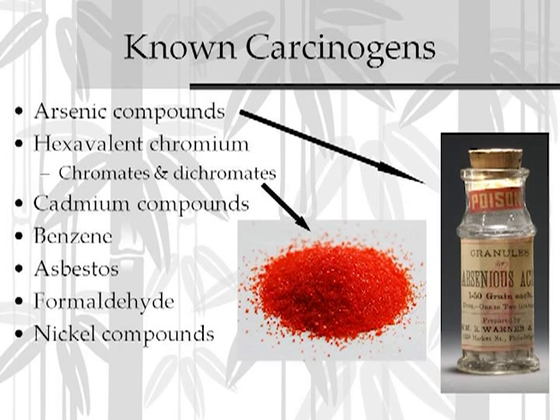Formaldehyde we still find fairly often, and generally where we're finding it now is in the actual tissues of the preserved specimens. So the sheep brains and the fetal pigs and those type of things. The holding solution should be something other than a formalin or formaldehyde solution. There's Carosafe and Flynn-Safe and Ward-Safe and these other ones, which are a propane diol or propylene glycol solution.